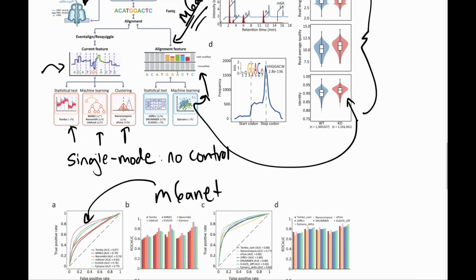That's because these tools were trained on human samples, which have different dominant motifs for where m6a modifications are present when compared to plant samples. And so in order to utilize these tools, they need to be trained on new ground truth datasets, in essence, in order to make them more applicable to these more distantly related species.